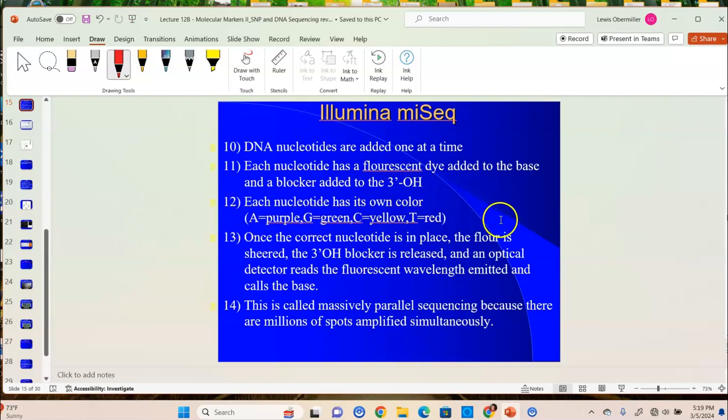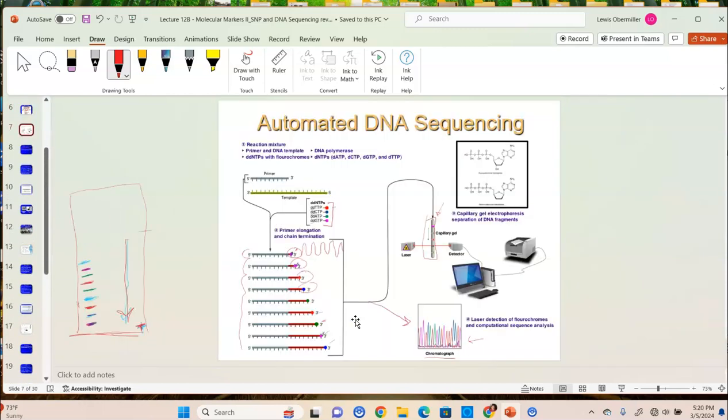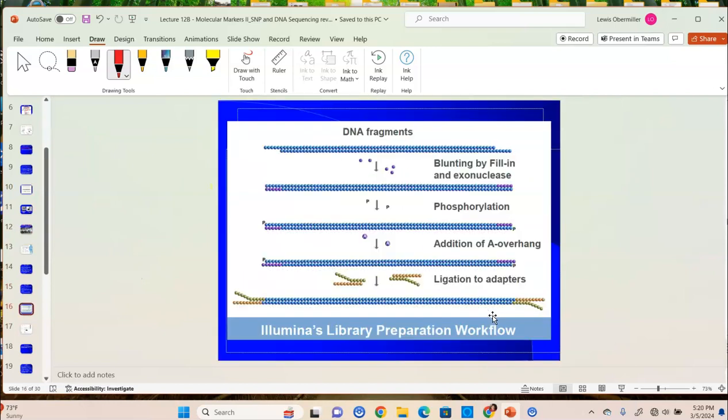So each nucleotide has its own color, just like we talked about. Once the correct nucleotide is in place, the fluorescent dye is cut off, the blocker is released so that we get the next nucleotide incorporated, and then there's an optical detector that reads this, just kind of like the Sanger automated sequencer, but this is done by looking at lots of spots at the same time. So in the old school method that we talked about, we can only read one letter at a time, right? Maybe there's like 100 wells on here, but there's only so much space. And what makes this cool is that we can actually look at a whole ton of reactions.